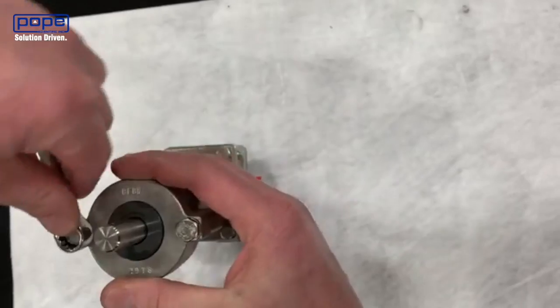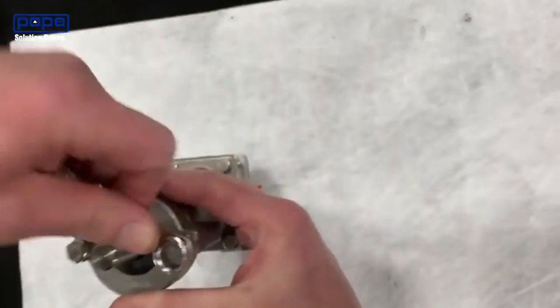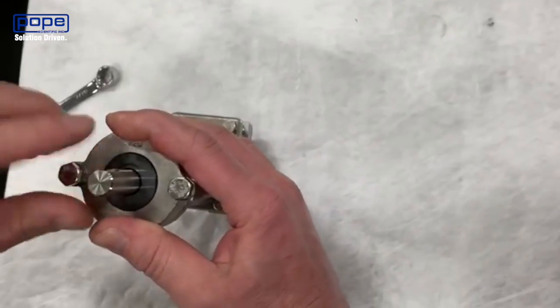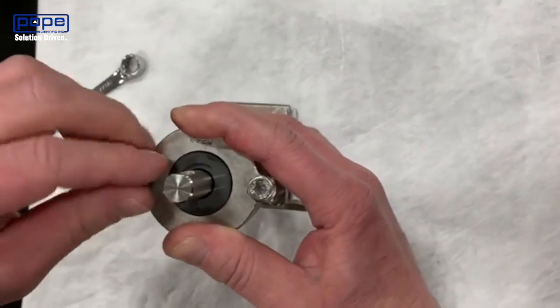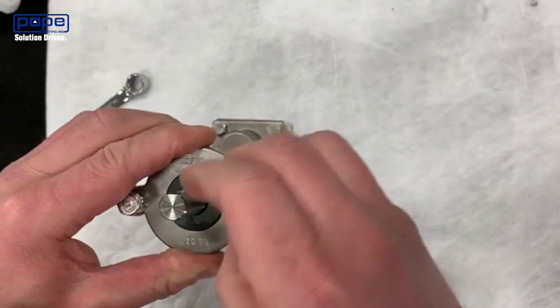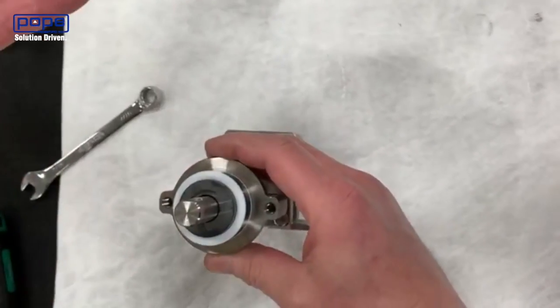Once the plugs are off, you can remove the two bolts that are holding down your gland plate. The gland plate is the portion that's on the outside here. Once Dave gets those bolts out, you can remove the gland plate.